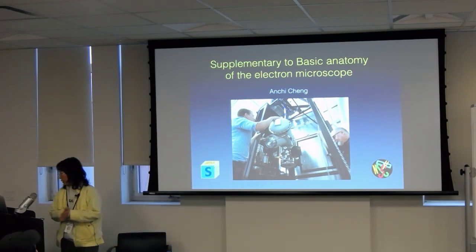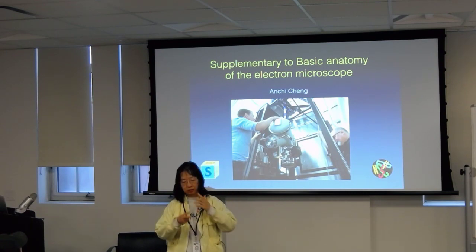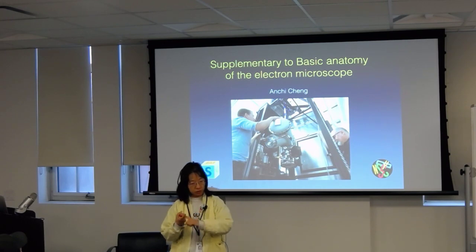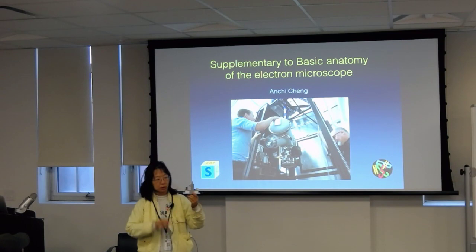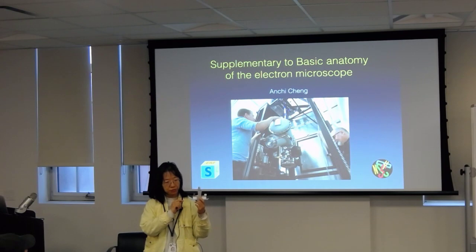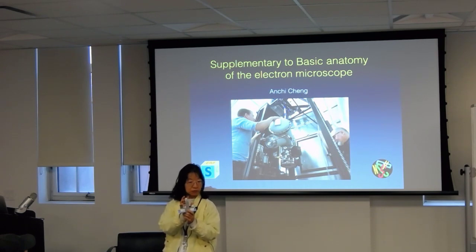Okay, now to my part here. Now one of the things that we found out by surveying you guys is the microscopes that you see. So you have a low-end scope, which you probably saw, it's more like this. It's open in a room, right? You can sit in front of it and operate everything. So this is typically the lower-end microscope. It doesn't have any kind of shield around it. It doesn't go inside the box. Okay, and that's because everybody does it right in front of it.